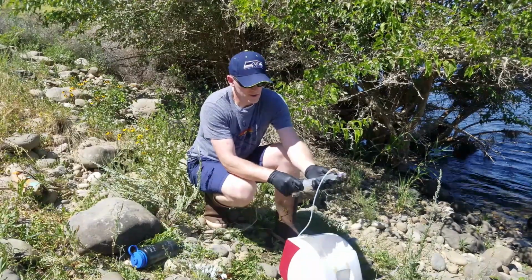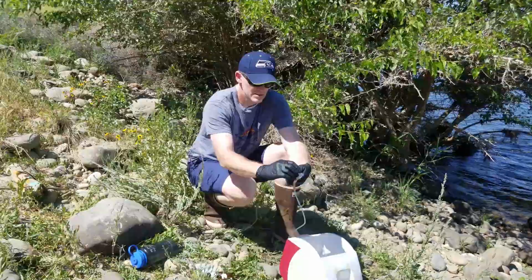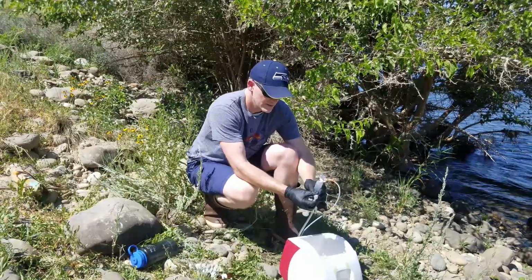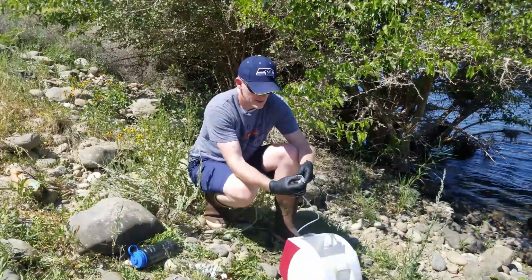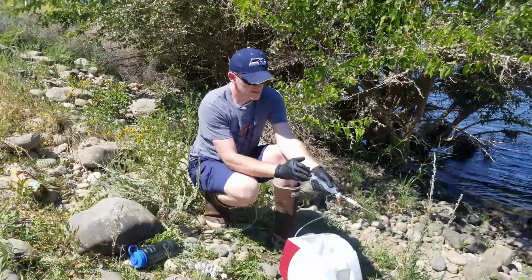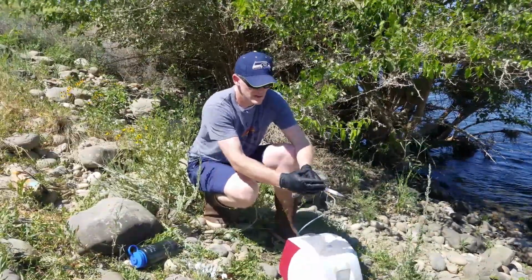Remember, you want to go slow. I'm going a little bit too fast here, just to keep things moving in the video. But remember, about a minute to fill up this syringe. Once you've filled it, flushed it three times, now you're ready. And so here, you can take the filter off the previous push point, attach it on here. Remember, you've already got a new needle on there. Make sure you flush it well. A few mils through there. The inside volume of this is about 3 milliliters. If you push 10 mils through, you've done a pretty good job of flushing the system.